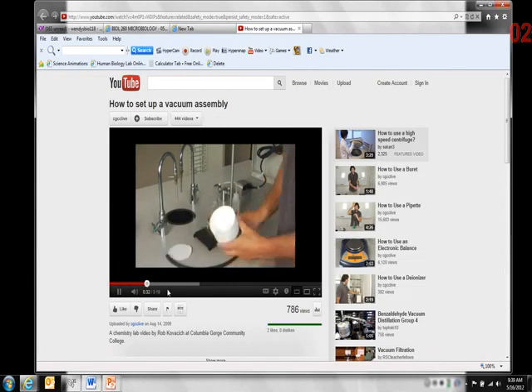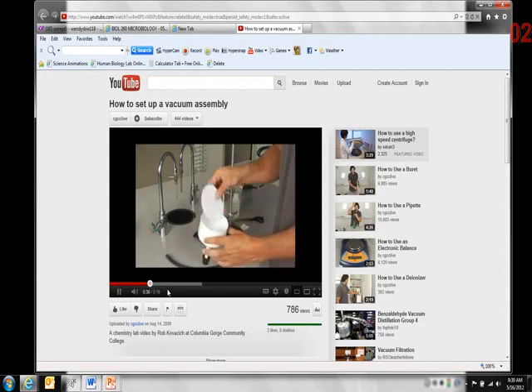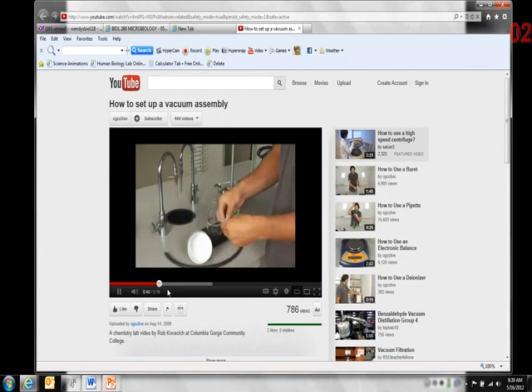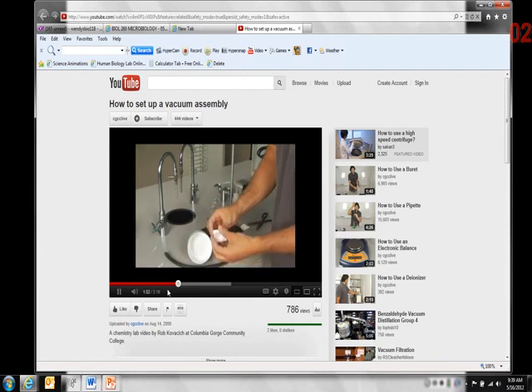So what we'll do first is accurately cut this piece of filter paper to fit inside here. The best thing for you to do is to fold the filter paper in half, and then into quarters, and into an eighth. That way your cut is very simple. You cut right along the edge. Just from experience, I don't think that's quite enough. There we go. What we're looking for is a piece of filter paper that will cover all of those holes in our filter.